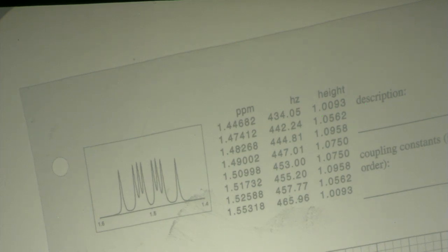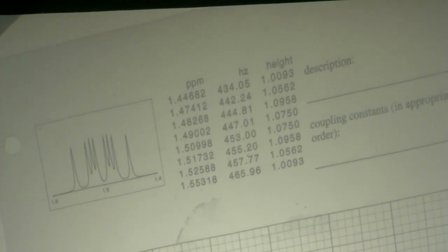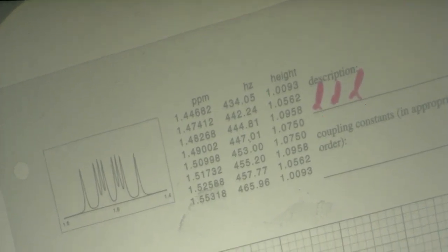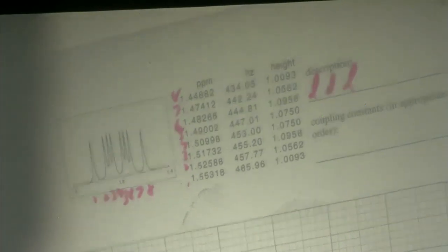All right. So, we will do this one here, which is the last one. We are split with three distinct coupling constants. So it is a doublet of doublets of doublets. And if we think about our lines here, 1, 2, 3, 4, 5, 6, 7, 8. Remember, normally you number from the top. All right, we name it big J, medium J, small J.